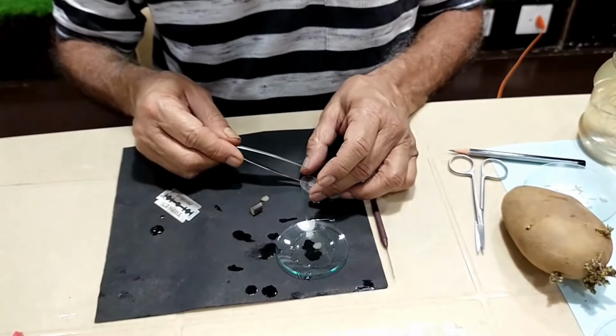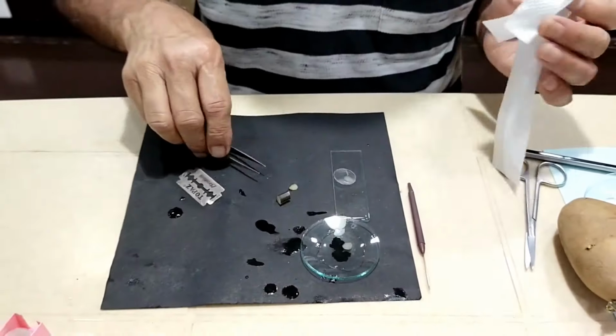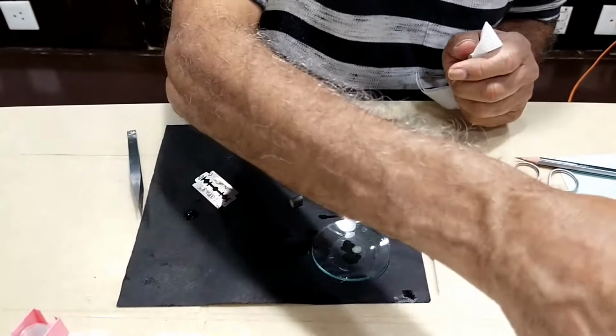I'm just putting a cover glass here. I'll lightly tap it, some water.